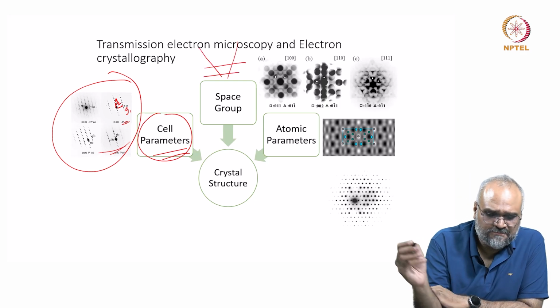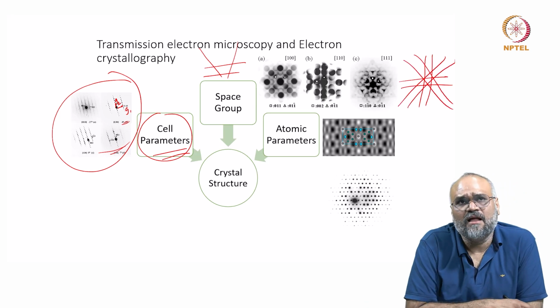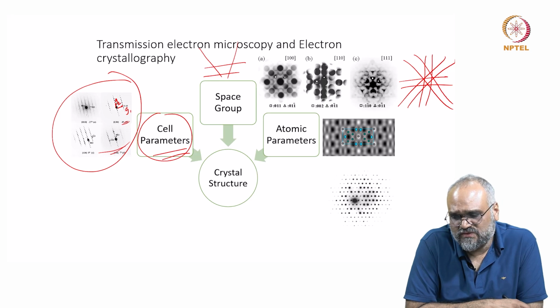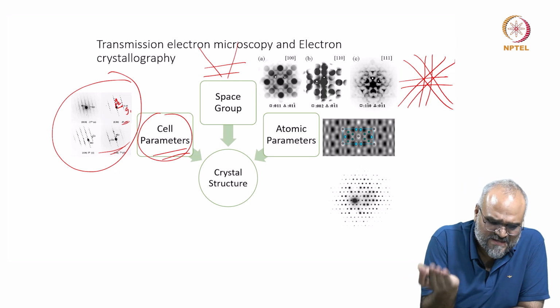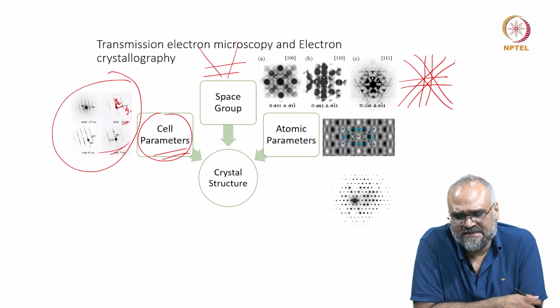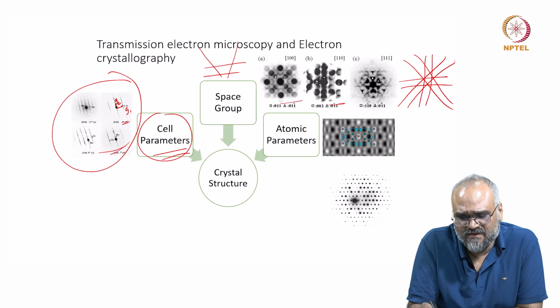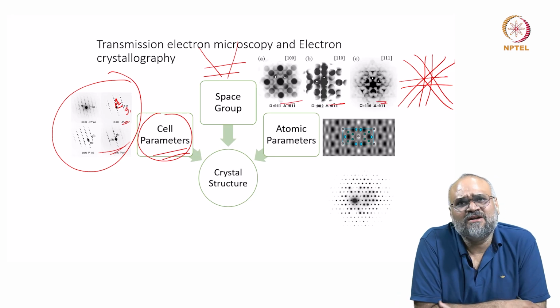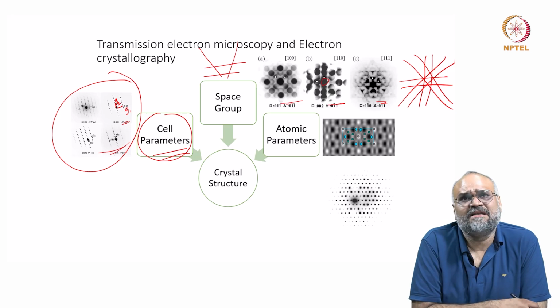and then within the specimen if I converge the beam I can either get what is called as a Kikuchi pattern which looks like this, or if I use a suitable convergence angle and a smaller area of illumination, and if I offset the specimen a little bit, either by changing the focus or by going away from the eucentric height, there are a few ways in which you can obtain these kind of convergent beam electron diffraction patterns. From these disks, I can determine how the symmetry is.